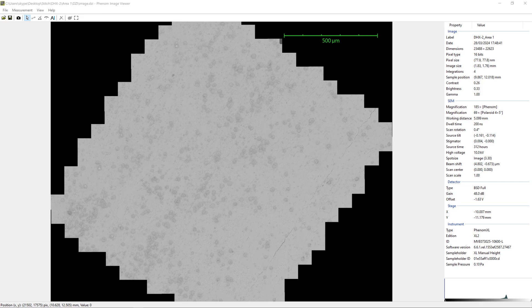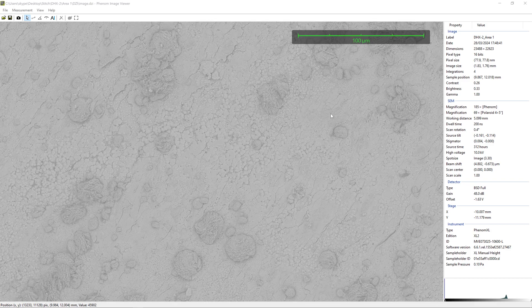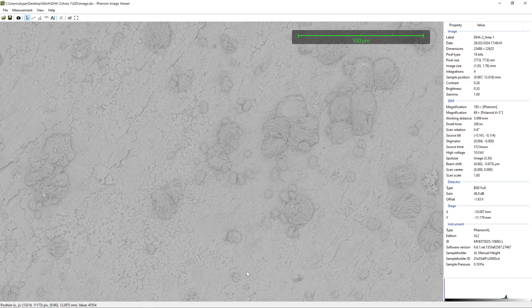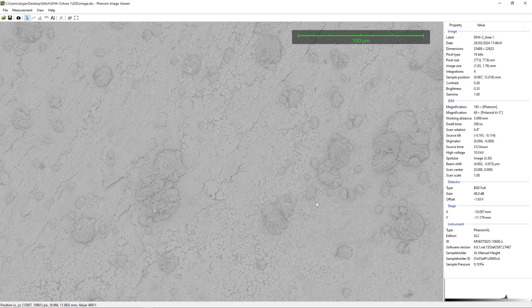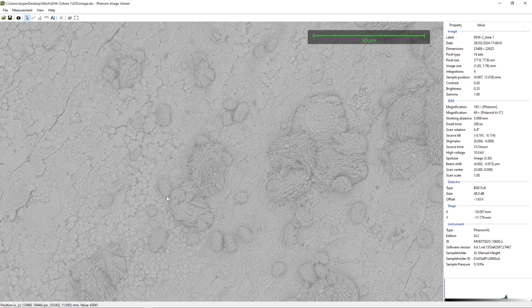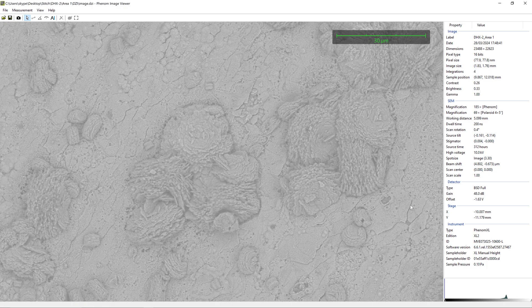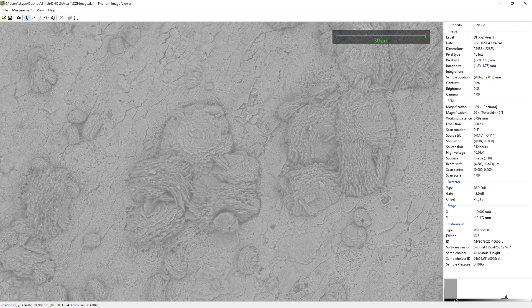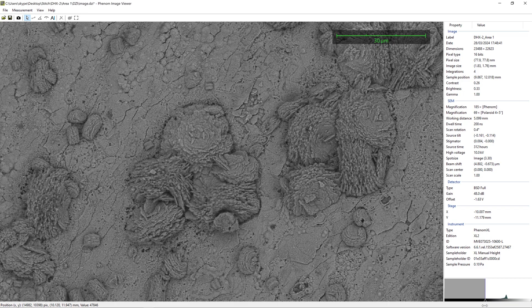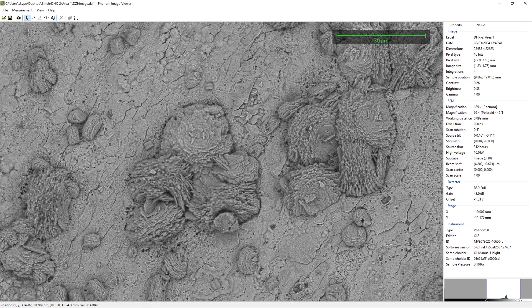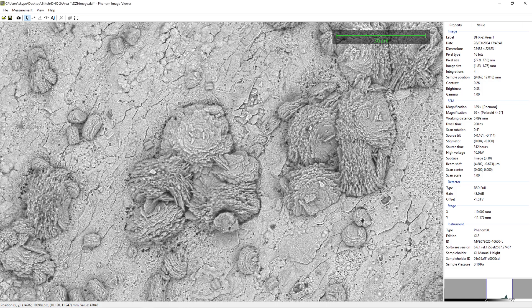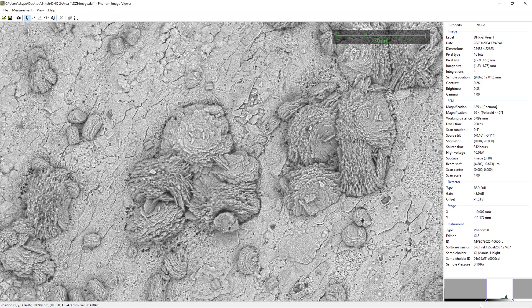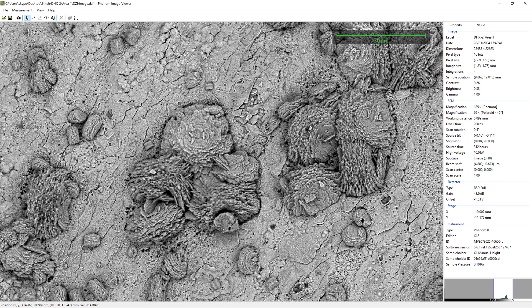Firstly, you can zoom in to the material and you can pan around it really rather nicely. And what you can also do is, down the bottom right here, you can adjust the contrast so that you can bring out the relevant detail of the wonderful sample. Thank you to Benjamin Huang for making this available to me on the 29th of December, 2023.